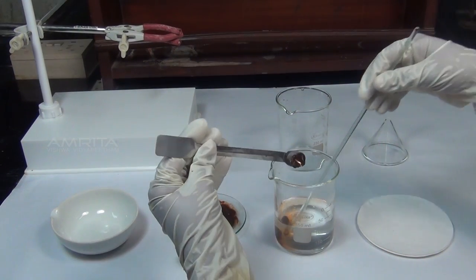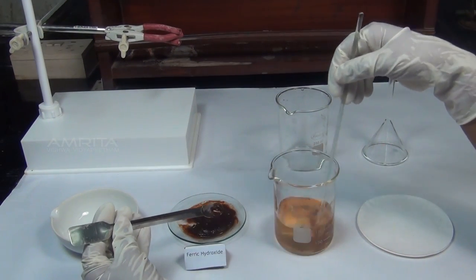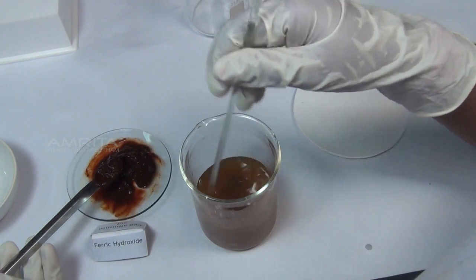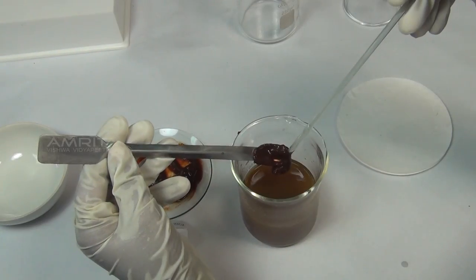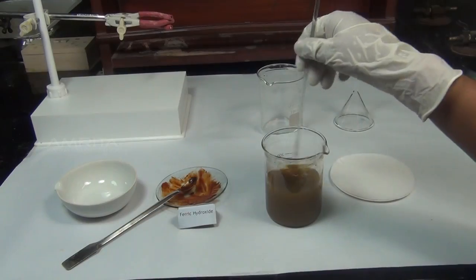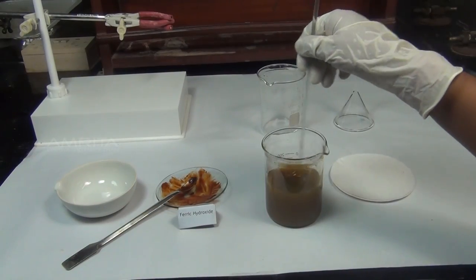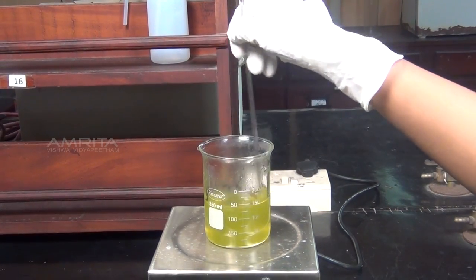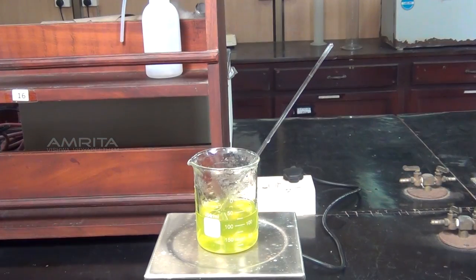Using a spatula, add freshly prepared ferric hydroxide precipitate in small proportions to the solution of potassium oxalate and oxalic acid with constant stirring to dissolve the precipitate. If the precipitate does not dissolve, then warm it and leave the contents for some time.